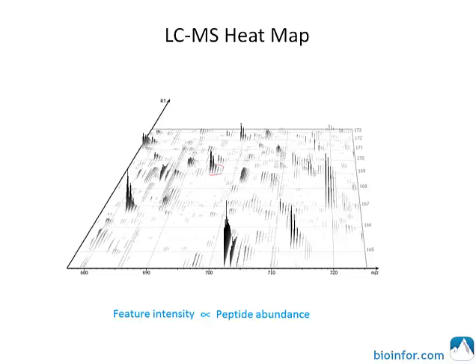This is the MS1 spectrum. This figure shows a heat map of the mass spec signals generated by peptides eluting from the column. The map depicts all peptide features detected by the instrument with the complexity of elution and isotope patterns. The intensity of a peptide feature is proportional to the abundance and concentration of the peptide in the sample.